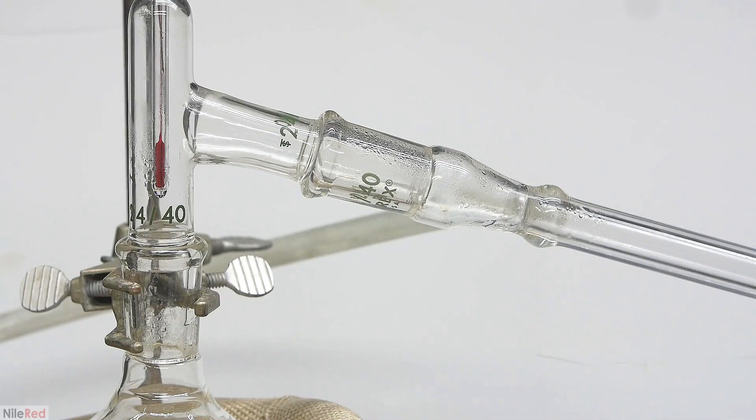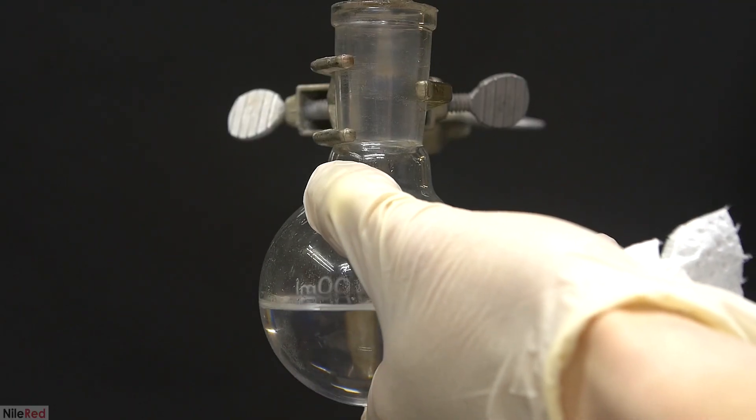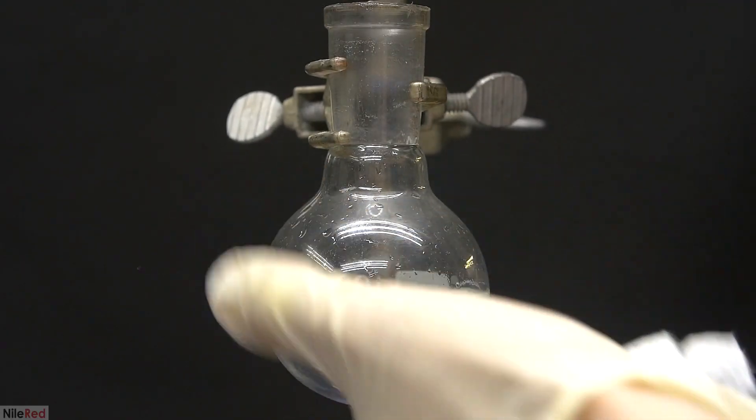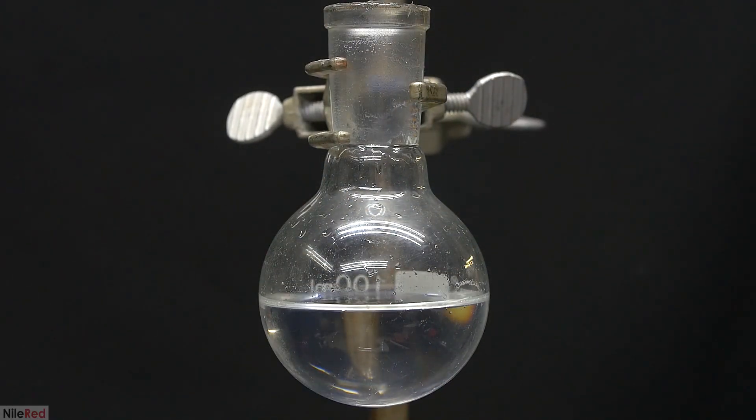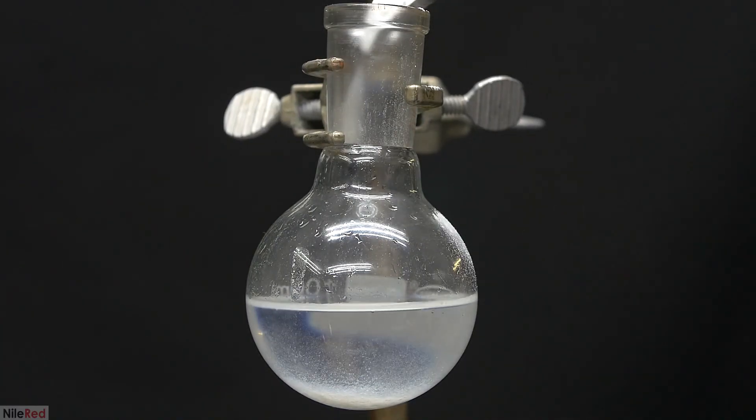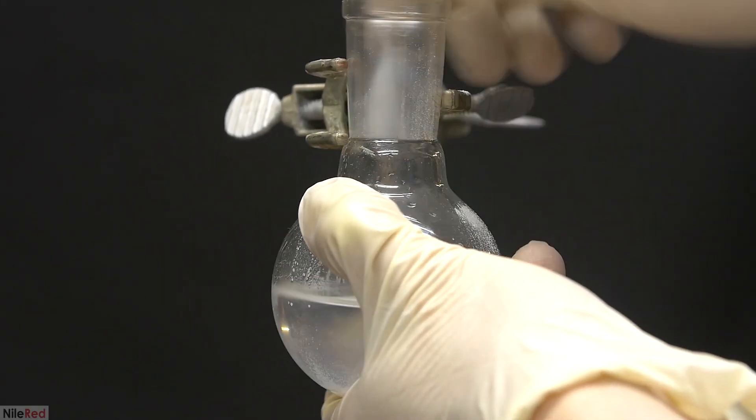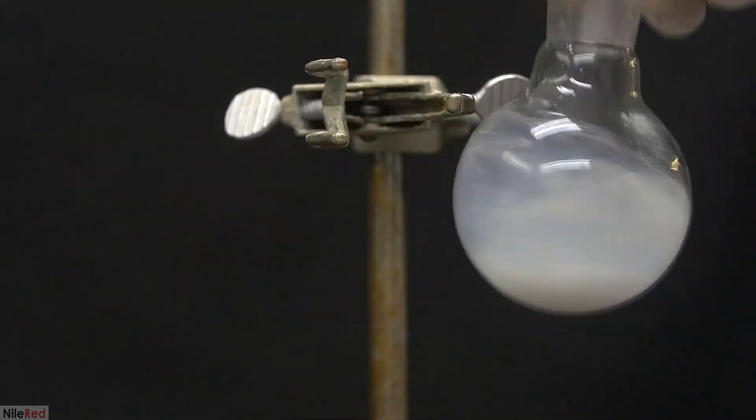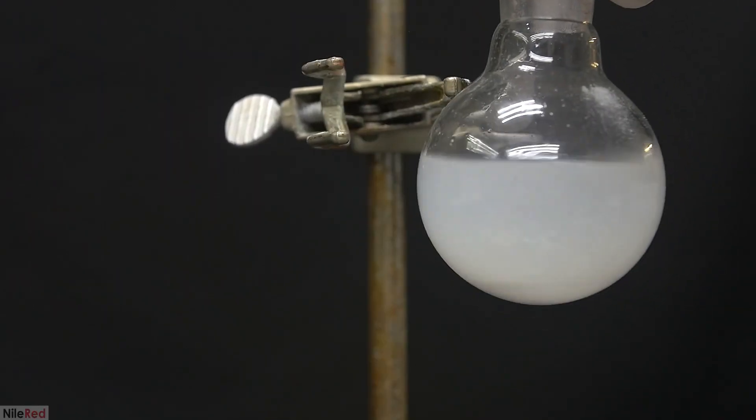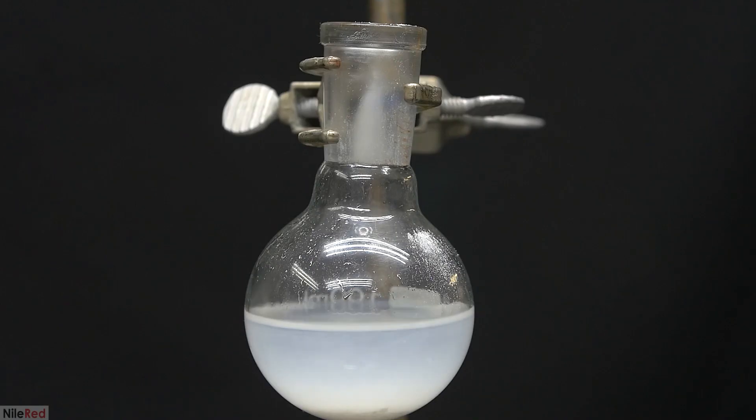The essential oil of bitter almonds is almost pure benzaldehyde. Depending on the source, the essential oil can sometimes be used directly in synthesis without any prior purification. To be safe though, it's always best to purify the oil and that's what I'll be doing in this video. This method saves a lot of time and doesn't cost too much.